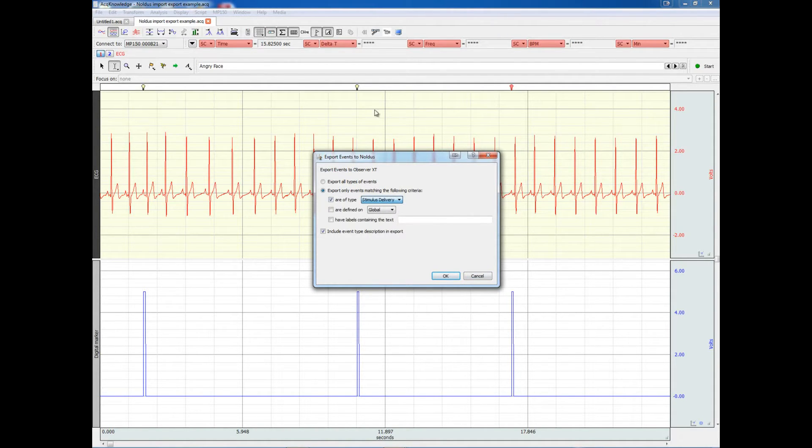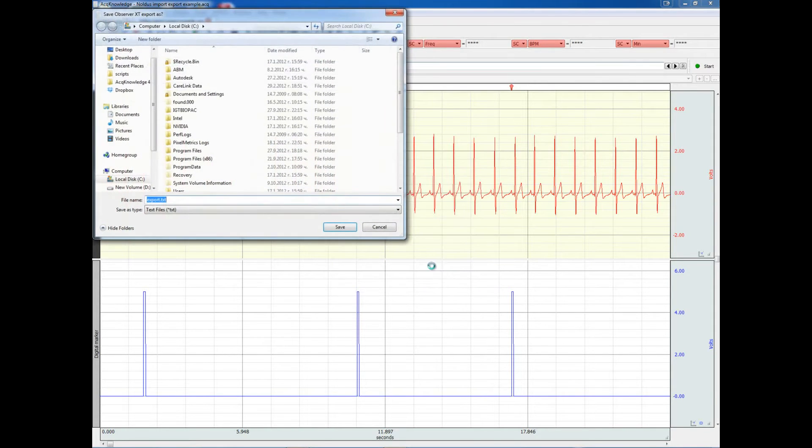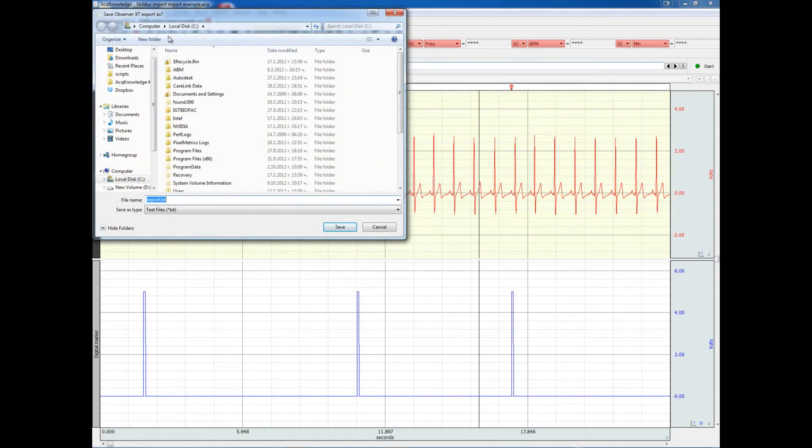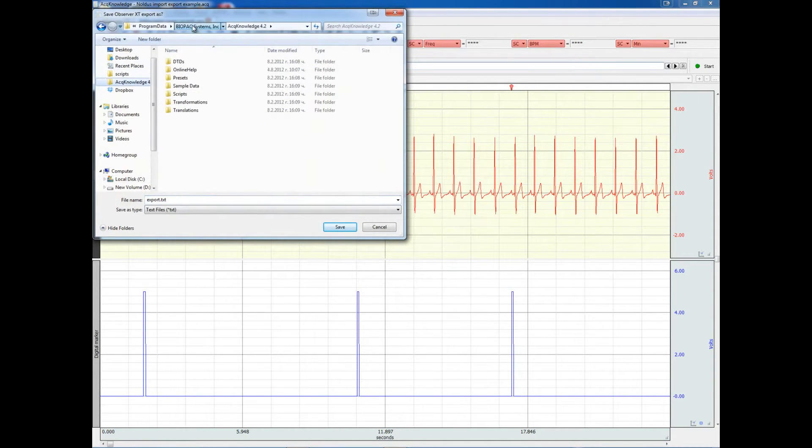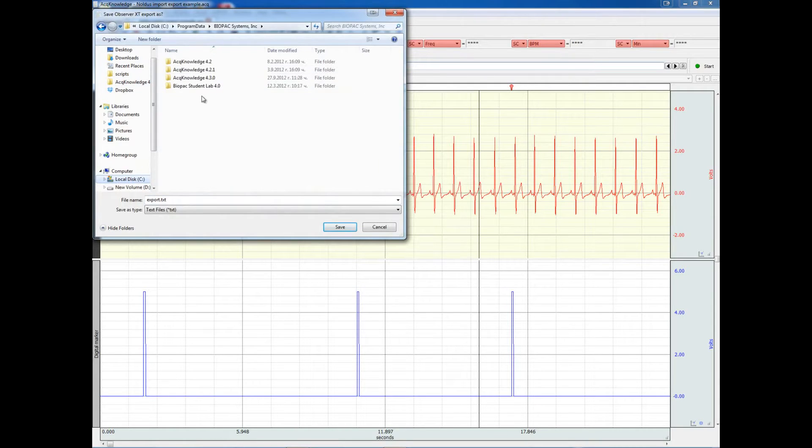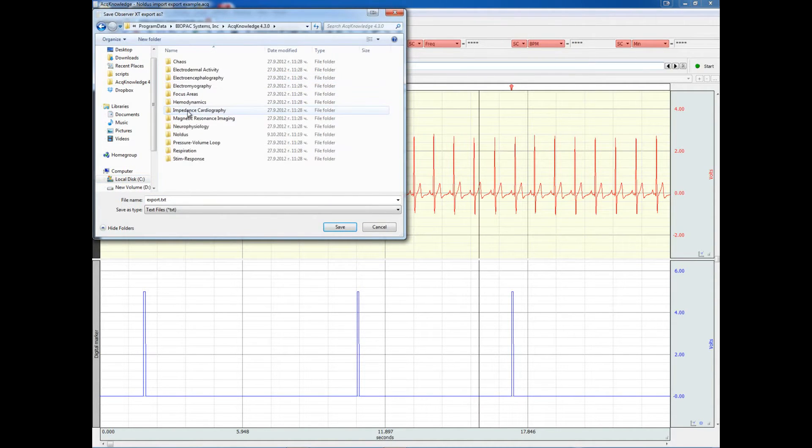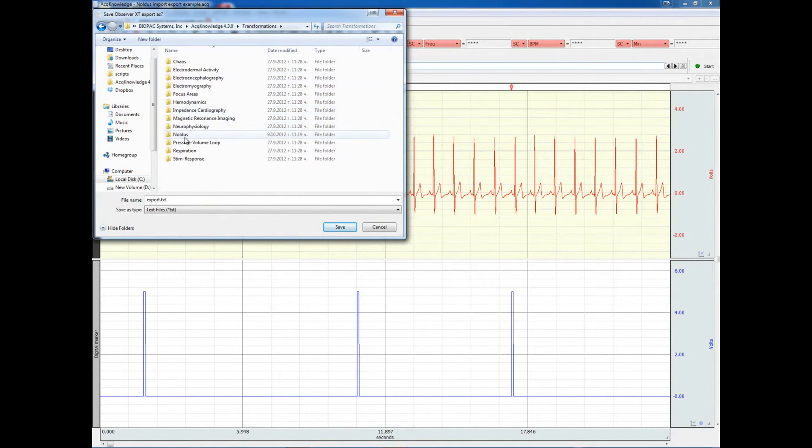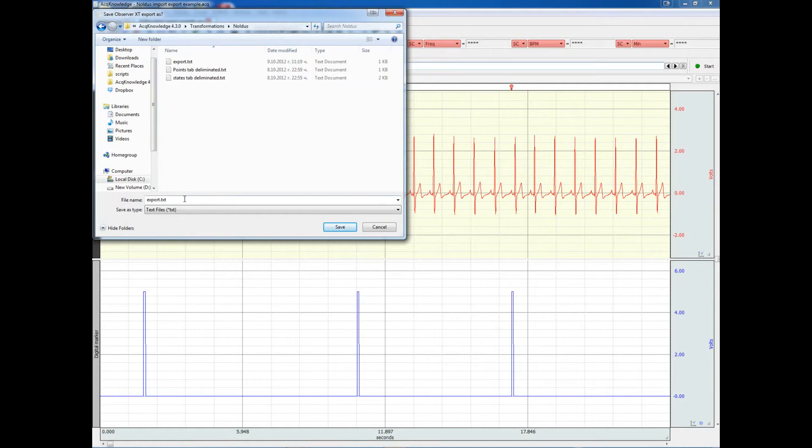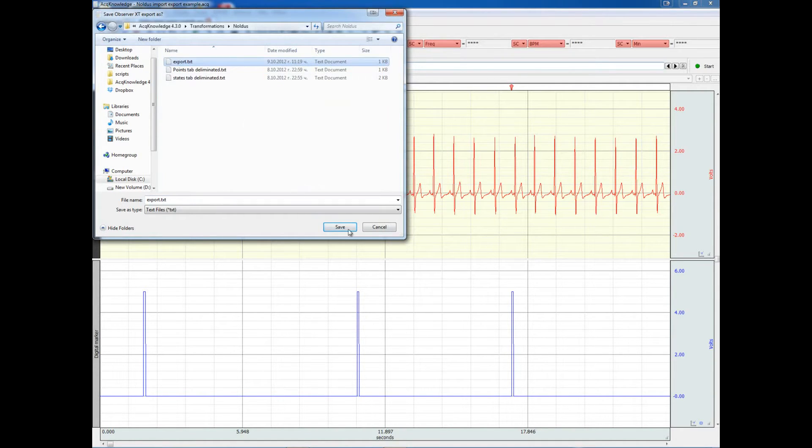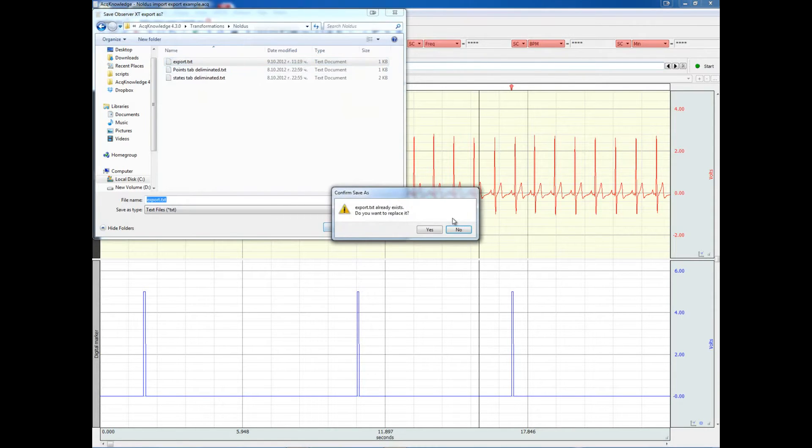We may, in fact, have many more different events in the file. Then we just have to select where to save the file and what will be the file name. And for right now, we'll just save it where we have all the different nodes files. Save.